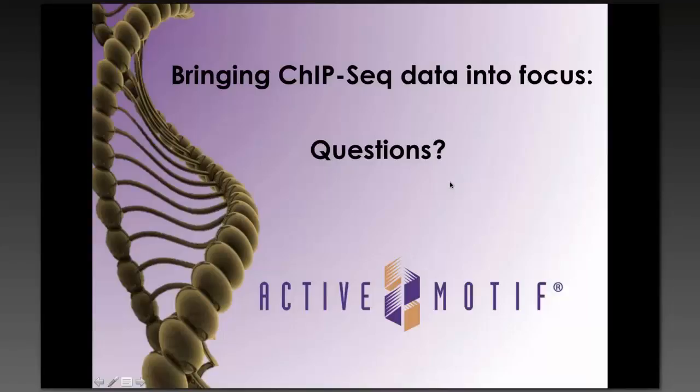And again, since every sample is getting the exact same amount of Drosophila chromatin, even with biases, they should be behaving equally. Back to the starting material question. If you were to ensure the same amount of starting material with and without EZH2 inhibitor, where less DNA is presumably being pulled down, do you think that would eliminate the artifactual overamplification, therefore ensuring that the same amount of DNA is used in the control and inhibitor treated?